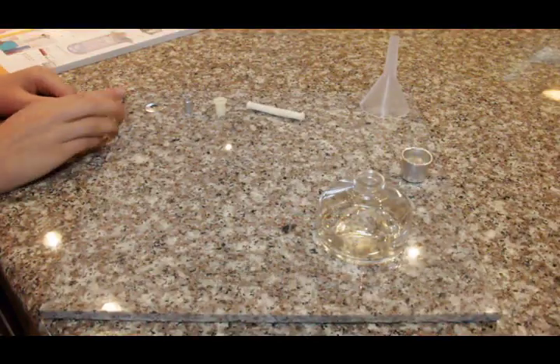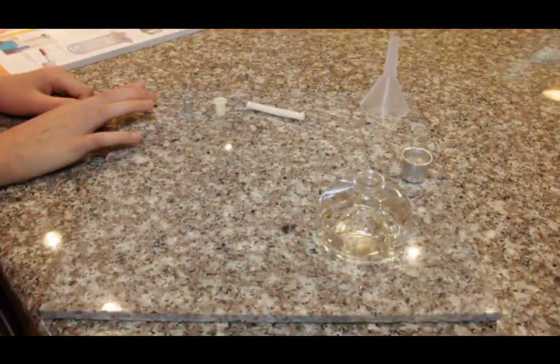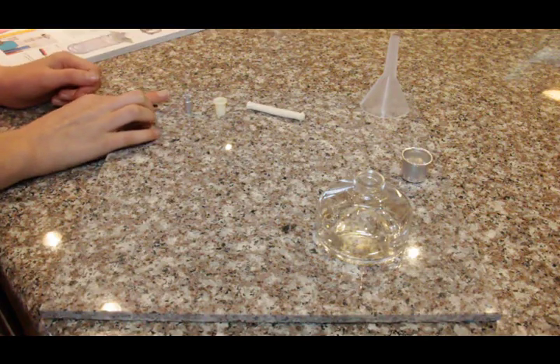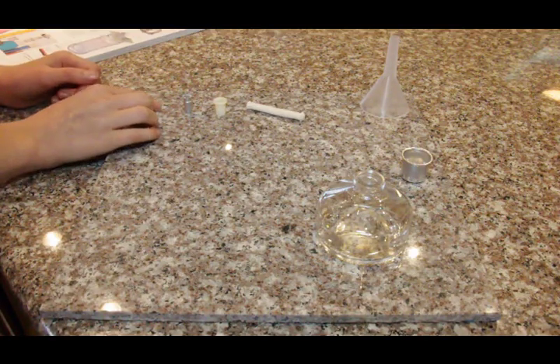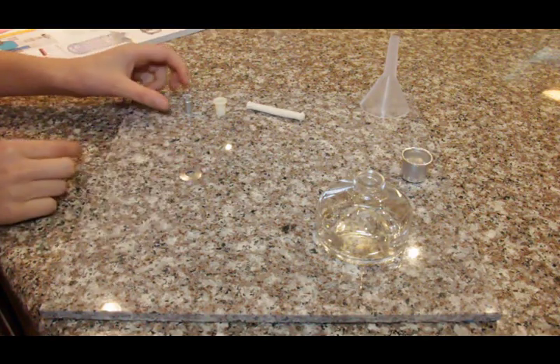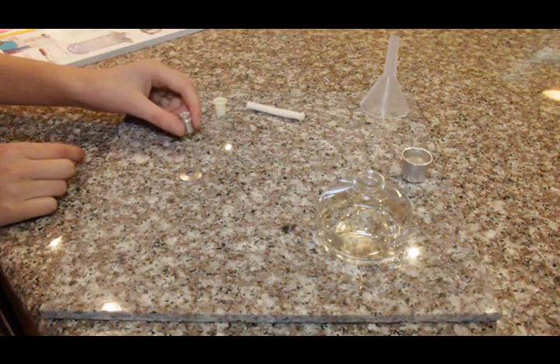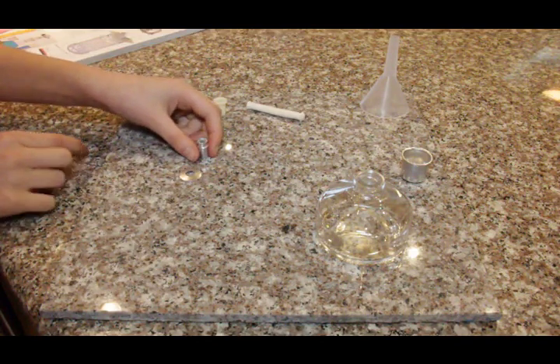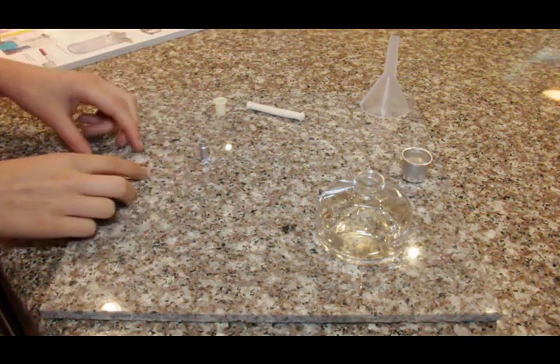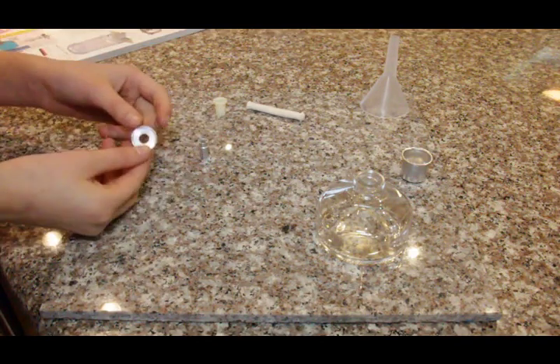To assemble the alcohol burner, you start by taking this aluminum disc and the wick holder. To put them together, look at your aluminum disc.